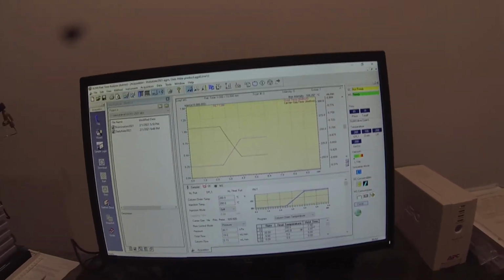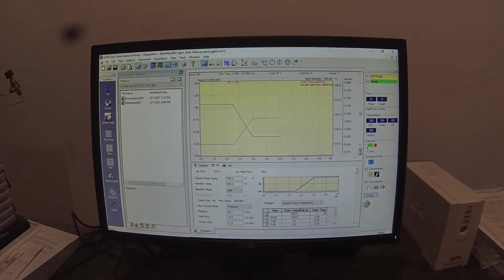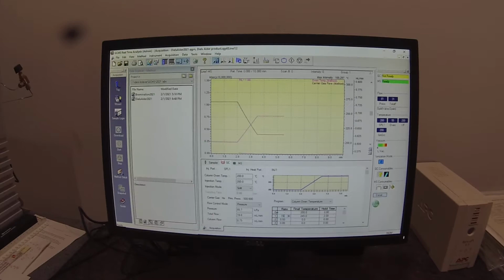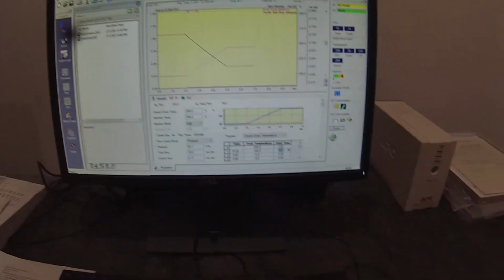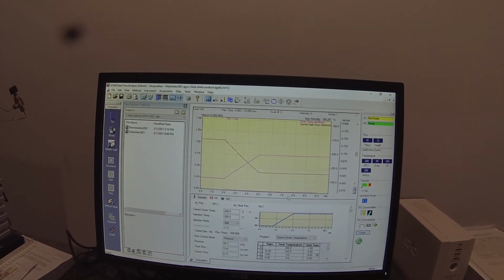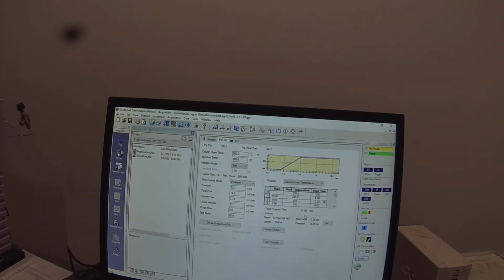Well, sorry. We'll hold it for about 2 minutes at 200. And then we'll rise at a slower rate. We'll rise at 15 degrees C per minute till we get to 245. And then we'll put a hold time in there about 6 minutes, which should be plenty long enough. If you look at our method detail, that's now an 11-minute run.